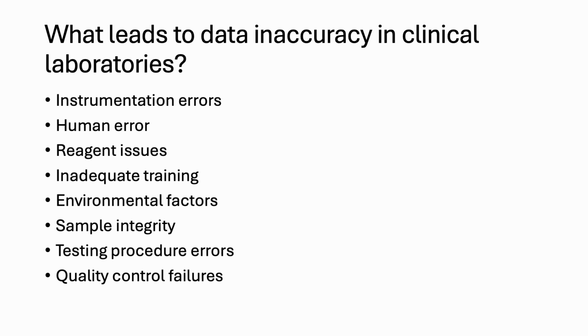Reagent issues. Using expired or contaminated reagents can skew test outcomes. Inadequate training. Laboratory personnel lacking sufficient training may perform tests incorrectly. Environmental factors. Temperature and humidity levels outside of specified ranges can affect specimen integrity.